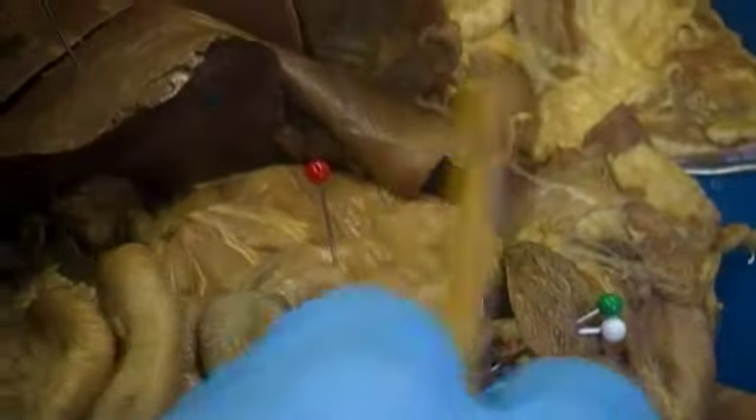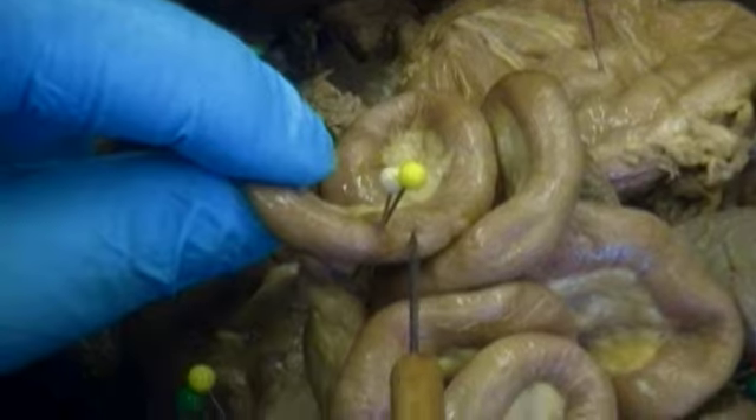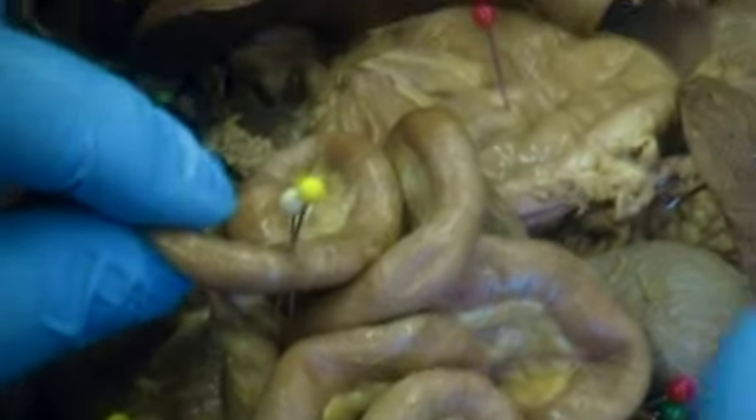The duodenum runs through here and forms the next part of the intestine, labeled with a yellow and white pin, which is the jejunum.